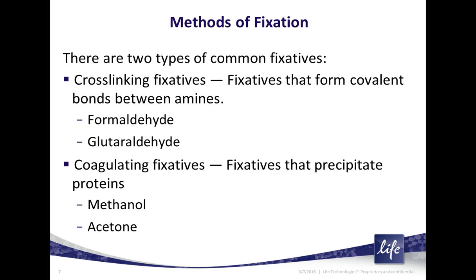Now, there are some exceptions. For instance, when you're fixing endoplasmic reticulum, sometimes you need a stronger fixation. Now, to answer one of the questions that came in, yes, you can, of course, stain cells without fixing, that is, staining live cells. Those antibody labeling techniques typically are for the cell surface, such as for CD antibody labeling in flow cytometry. But for most microscopy usages, you're usually looking for intracellular targets, and when you do that, you need to fix and permeabilize.